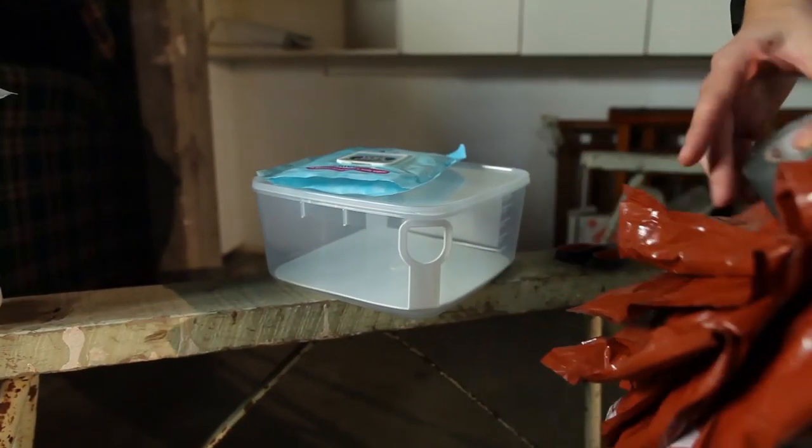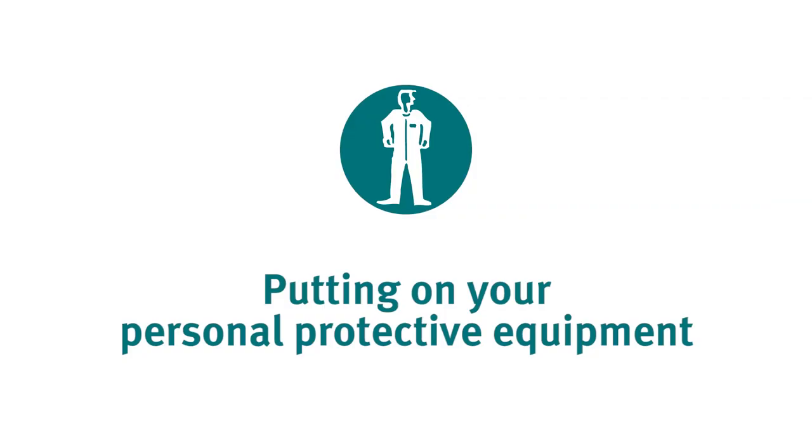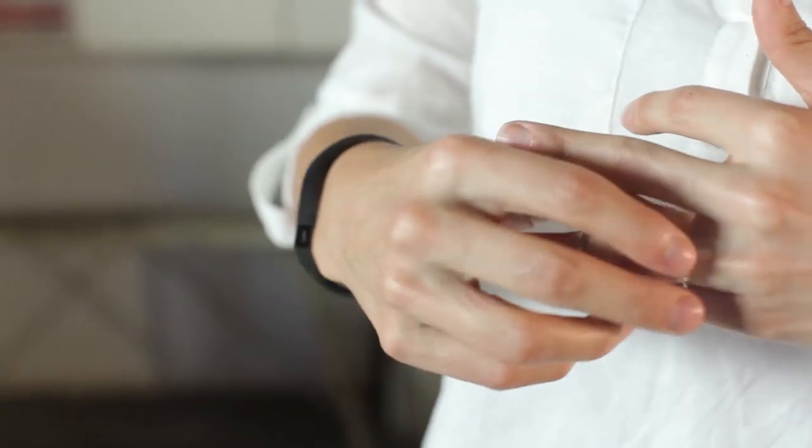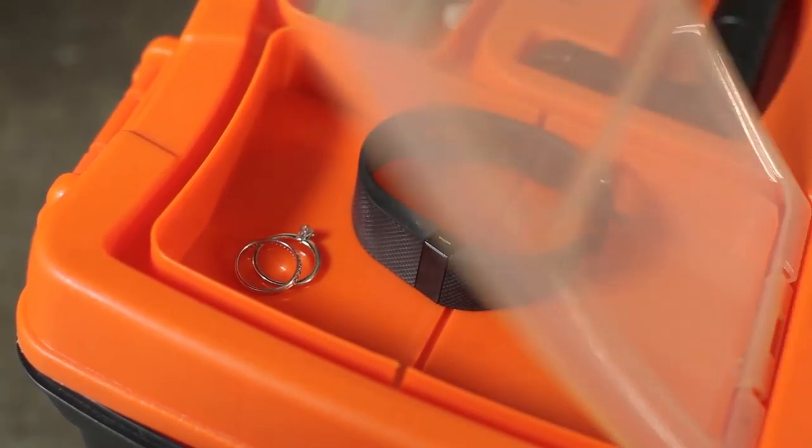Have a waste bag open and taped to the wall, ready to receive disposable items of PPE. Before putting on your PPE, remove all jewellery, including watches and wedding rings. Your PPE items must fit properly and be in good working order. If you are using a respirator, it must be fit tested.